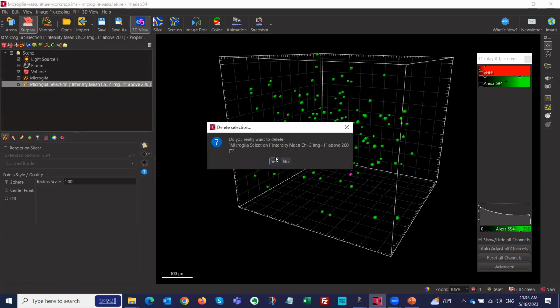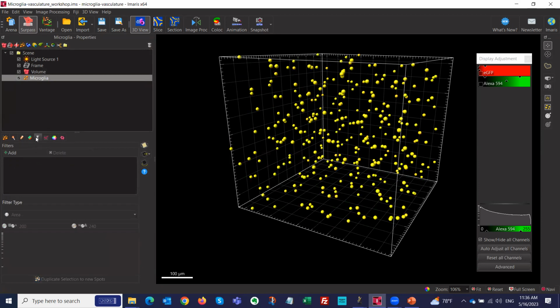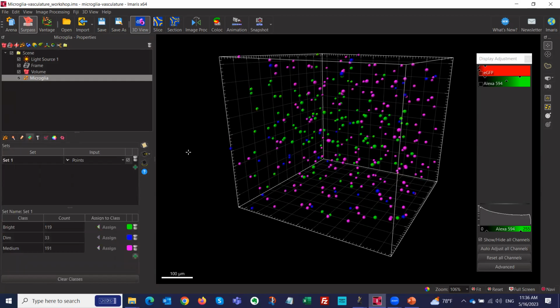So just briefly, the difference between the filter and the classification: the filter removes some things and lets you keep others, while the classification just color codes them. Maybe you're only interested in large ones, so you color code them green and the small ones blue, and then you just work with the green ones. It's preference. Sometimes you do want to completely remove them if it's noise, but sometimes you want to keep them as two or three populations. Then you use the classification instead.